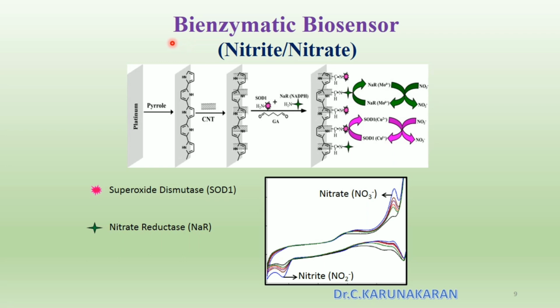For DRDO, we have developed a biosensor for the determination of nitric oxide metabolites, as these levels are very low in hypoxia patients or hypoxia disorder military jawans. In this, we have developed an enzymatic biosensor.